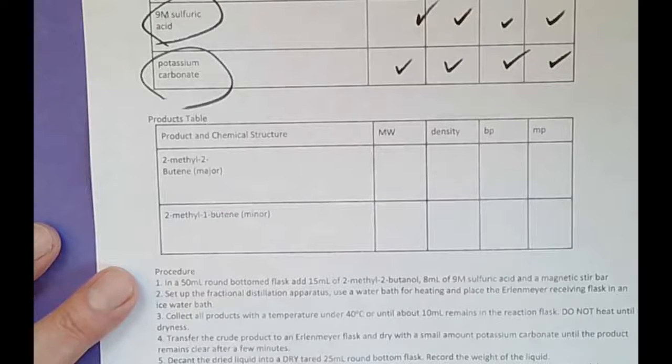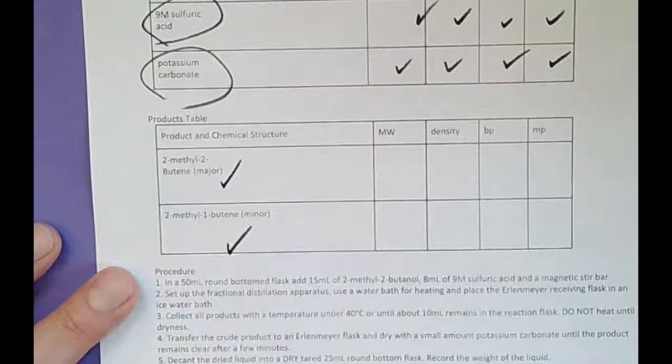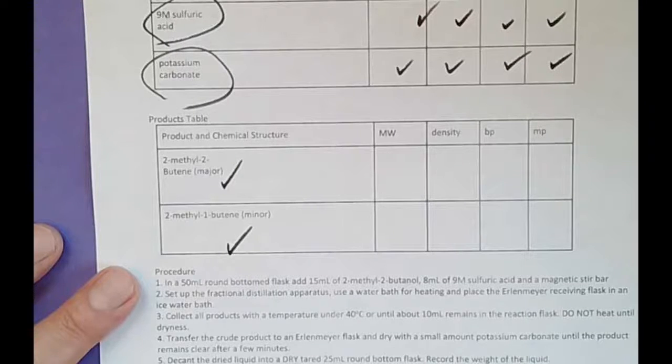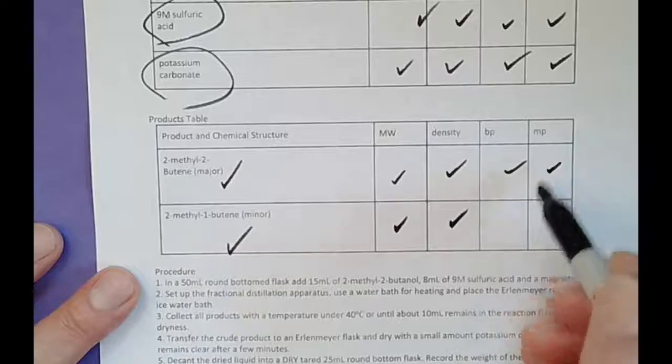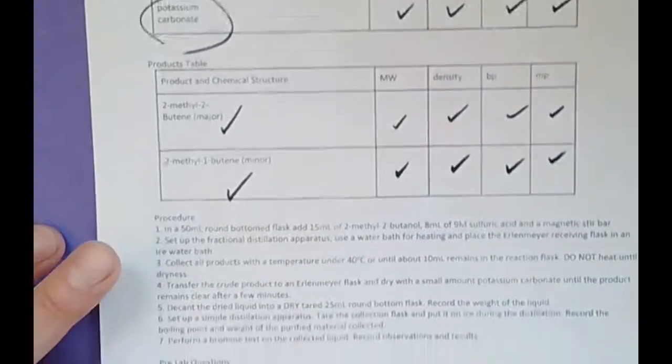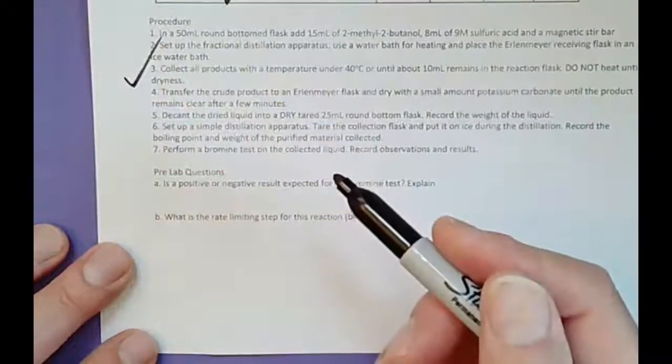Then we also ask them to look at their product. We have two products, right? One is major and one is minor. Again, go look for the molecular weight. It should be the same. Density most likely is the same. Boiling point and melting point are very similar or the same. Then, like SN1, we have a procedure. Read the procedure.